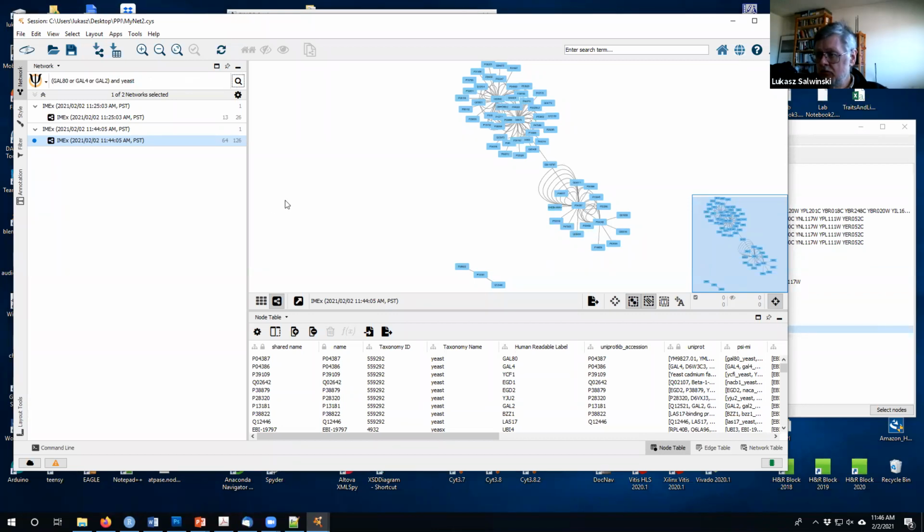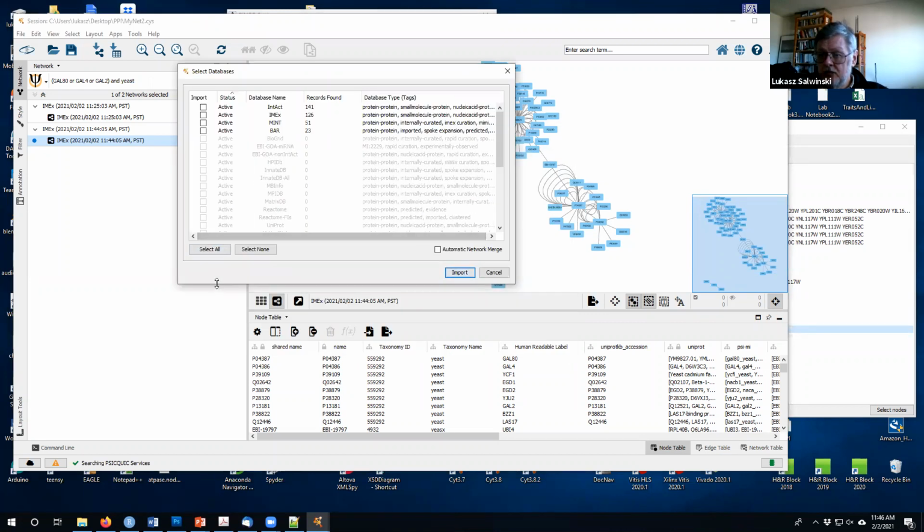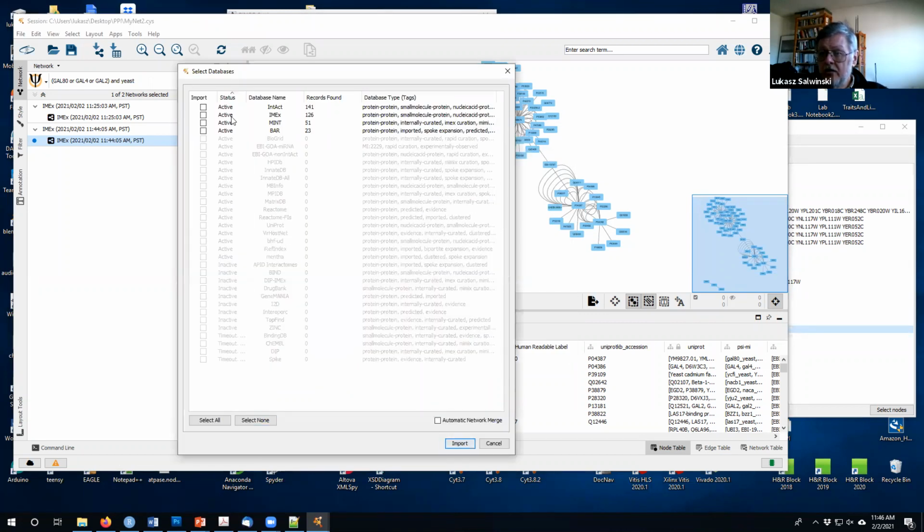Okay, just to show you what's showing up here. So this window is gonna show you a list of different servers, that different databases that provide information about interactions. In a PowerPoint file I dropped on a Google Drive, there's a short overview of different resources that deal with interactions. Some of them do show up here.